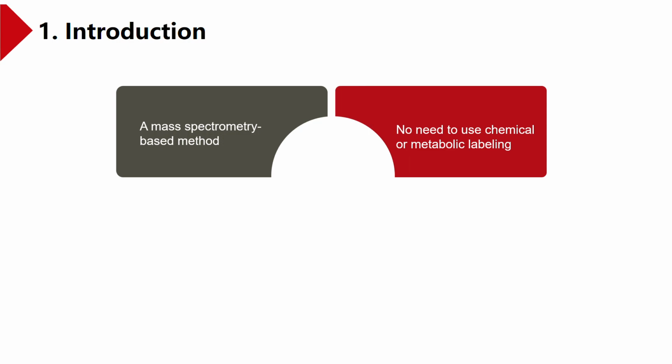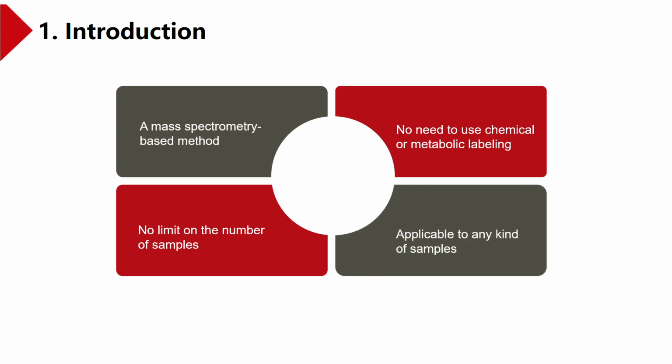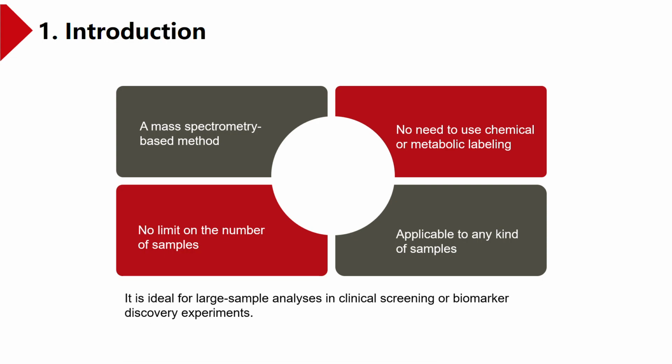There is no limit on the number of samples in label-free protein quantification, and it's in principle applicable to any kind of sample, including materials that cannot be directly metabolically labeled. It is ideal for large sample analyses in clinical screening or biomarker discovery experiments.